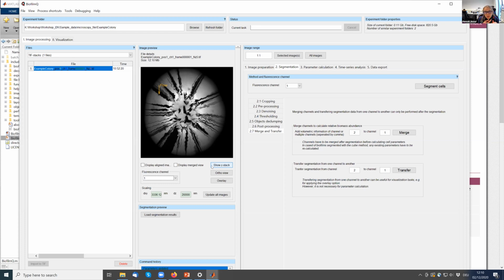And of course, we have chosen the cubes to be relatively small, which is why most of the cubes will be filled only with red fluorescent cells or only with green fluorescent cells. There will be some at the corner that are filled partly with red, partly with green. But overall, we will get 0 or 100%. And then what comes into play is averaging over the distance to the biofilm center. So we average over a ring in this colony, and in this ring we average over all cubes and check how much red and how much green we have in there.